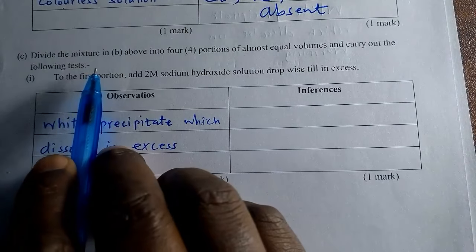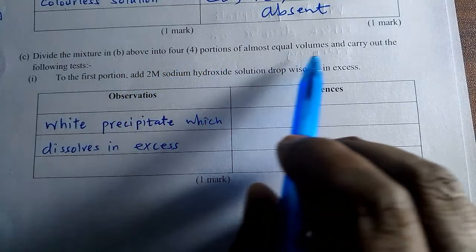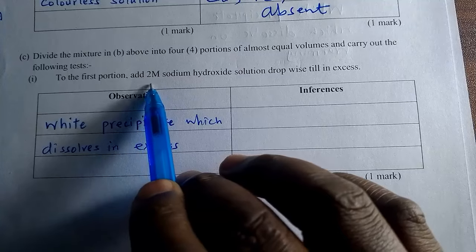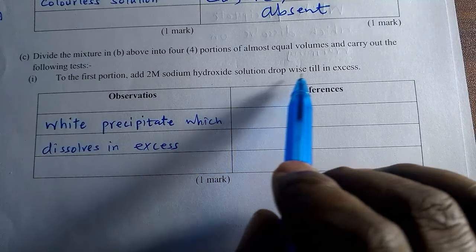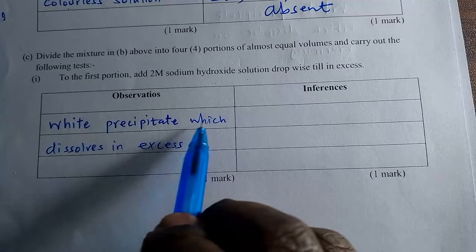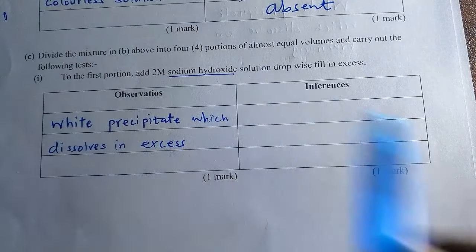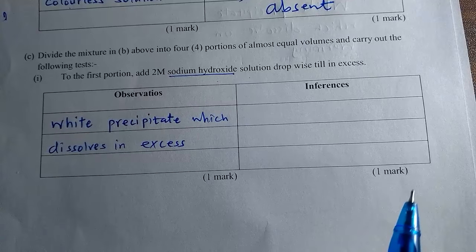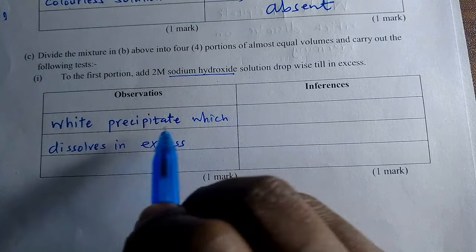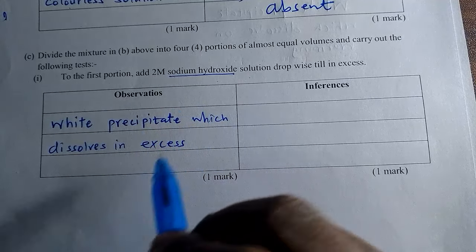Divide the mixture in B above into 4 portions of almost equal volumes and carry out the following tests. To the first portion, add 2 molar sodium hydroxide solution dropwise until in excess. The observation is a white precipitate is formed which dissolves in excess. Whenever you add sodium hydroxide and a white precipitate is formed, and when you put in the reagent in excess the white precipitate decolorizes, it means it changes from a precipitate into a colorless solution.